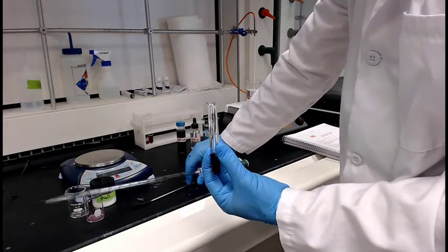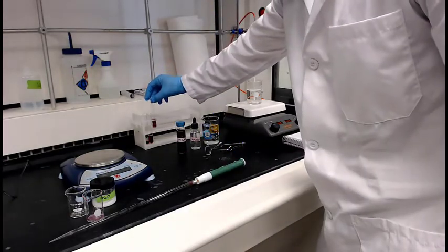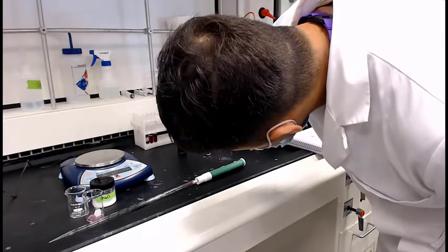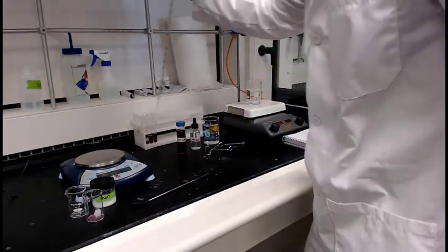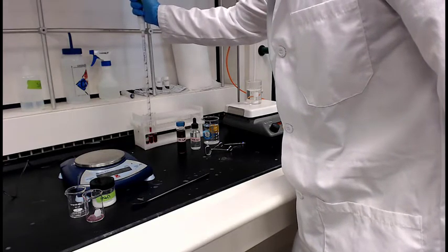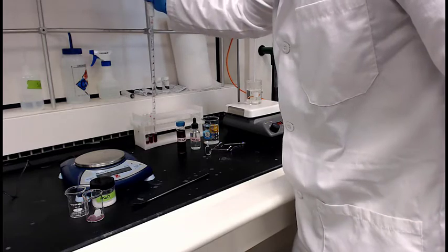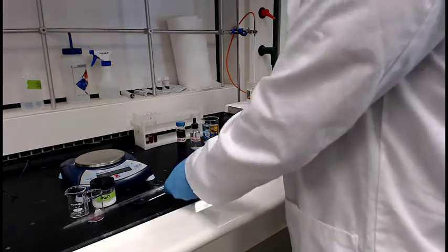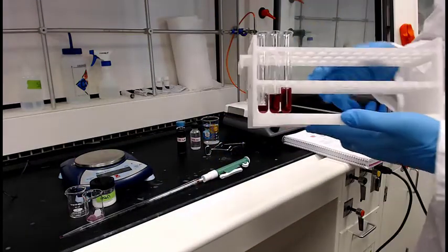Also, again, better technique than the last video. Came in wearing his gloves. Good on you there, John. There's Jonathan. There's Jonathan's left ear. All right. I'm not sure what he's doing there, but some sort of adjustment.